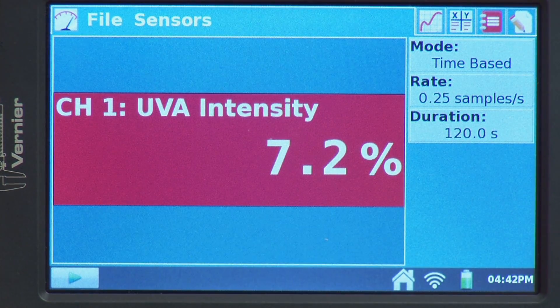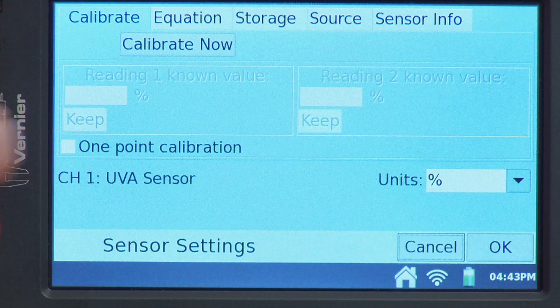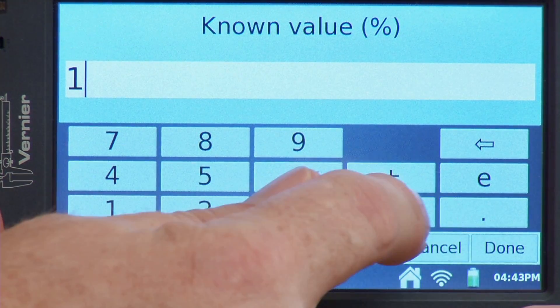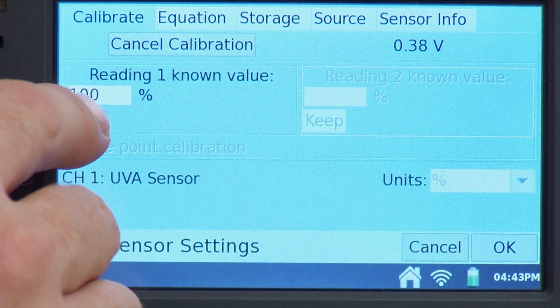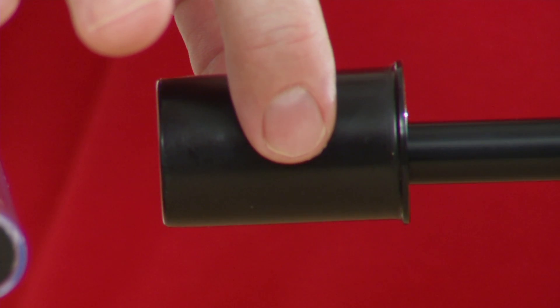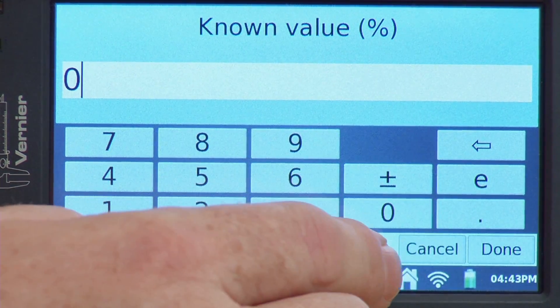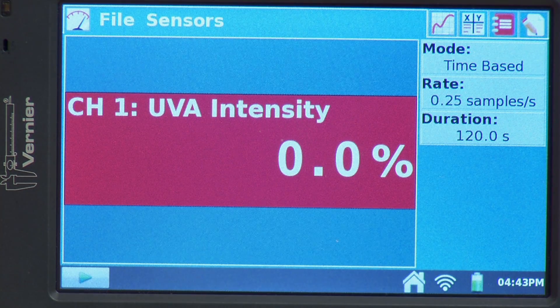I'm going to change the units to percent, and then run a calibration to tell it what 100% and 0% UV looks like. I'll go to the meter and select Calibrate. With my light source on, I tap the reading and set it as 100% of UV radiation reaching the sensor, then tap Done and Keep. Next, I cover the UV sensor with a film canister to block it out, set that point as 0%, tap Done, and hit OK. Now we have the relative UV reading — removing the film canister brings it back up to 100%.